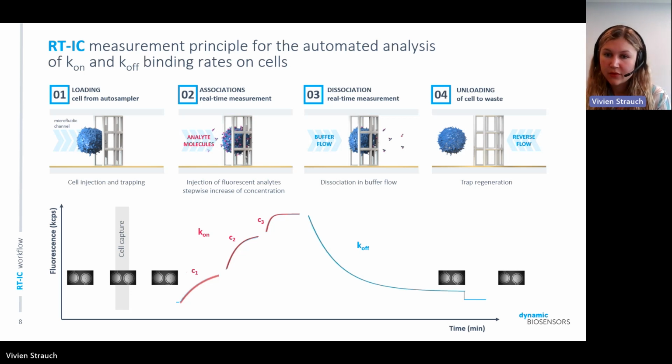Would it be possible to establish a displacement assay? Yeah, sure. I mean, we don't have any preset assay for competition assays right now, but we are always happy to test this. And from the technology's perspective, this should work. So if you have an application for a competition assay or a displacement, I'm happy to discuss this in more detail, and we could just try it. But I don't see why this should not be possible.